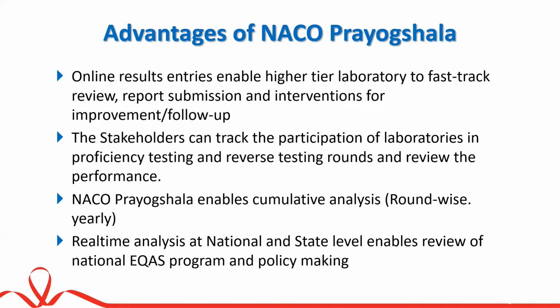In this way the data was compiled by the different stakeholders and different tier laboratories, and then received by NACO from the different states. So receiving itself was time consuming, and the amount of data available in the form of Excel was also huge. So the analysis was tedious and cumbersome for NACO in a timely manner.